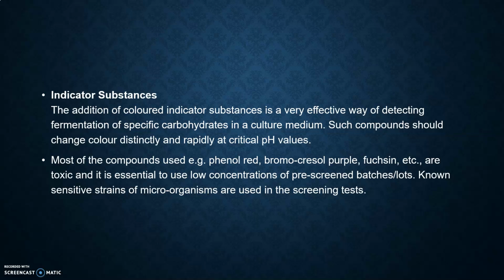Most of the compounds used, for example phenol red, bromocresol purple and fuchsin, are toxic, and they should be used in low concentration in pre-screened batches or lots.